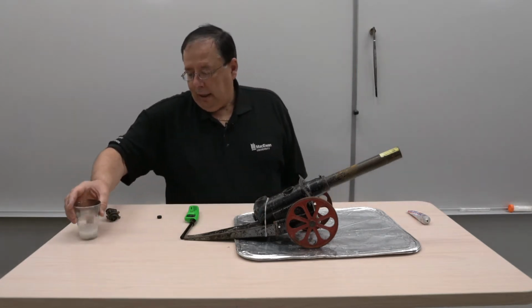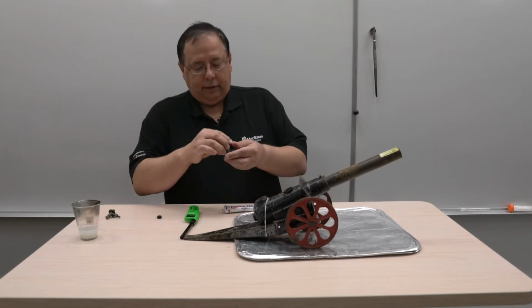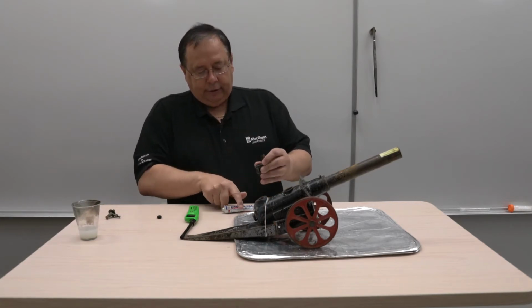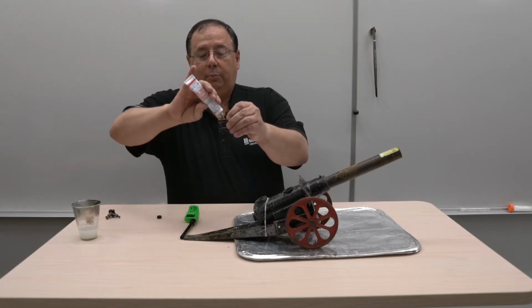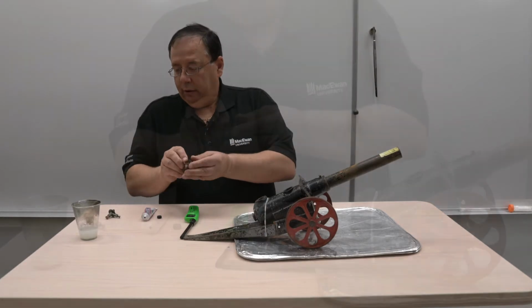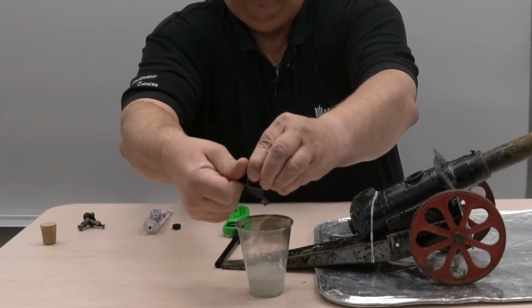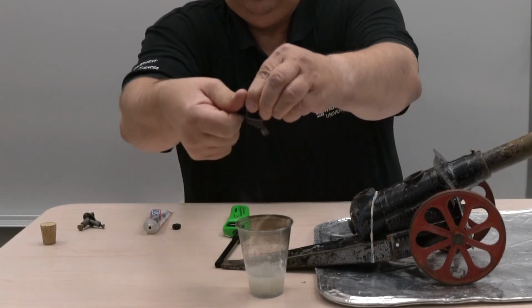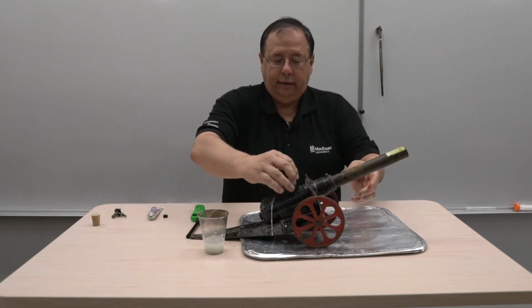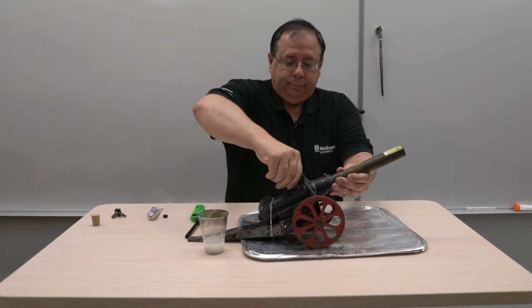And we're going to have to add the calcium carbide as well. However, I'm going to use a little technology here. This little device here, what it does is, when I place the calcium carbide in, it will give us just a small amount of that calcium carbide. And that's about it. And if I let it go, it refills that container. I'll put that right over top of the water here.